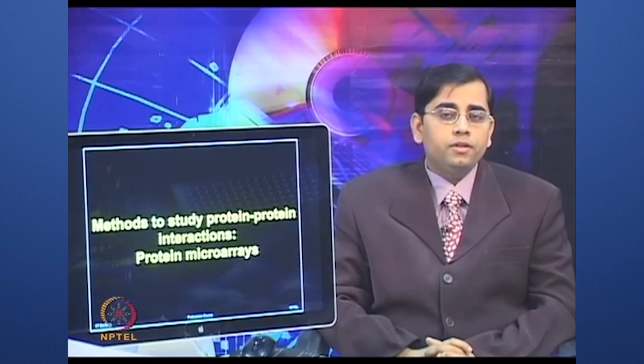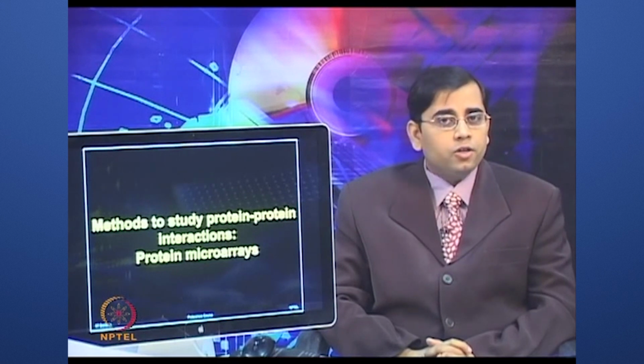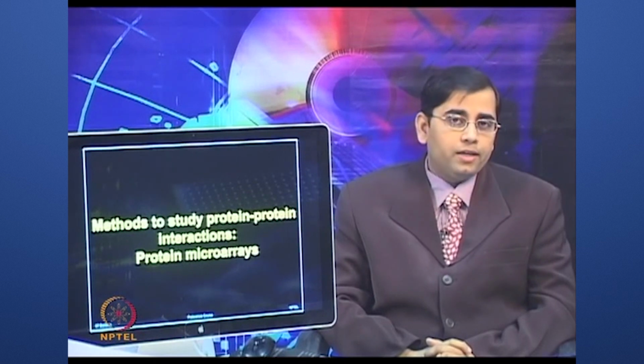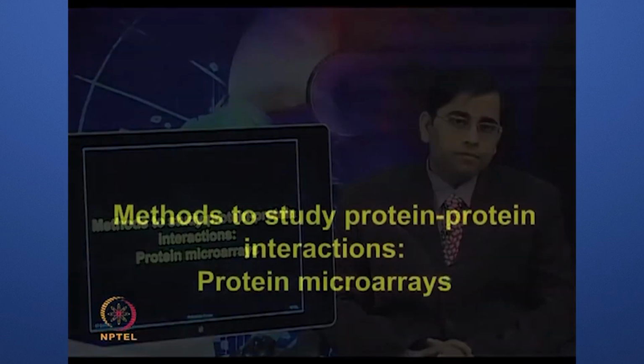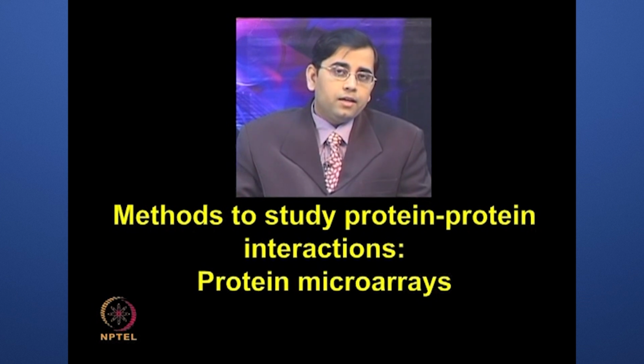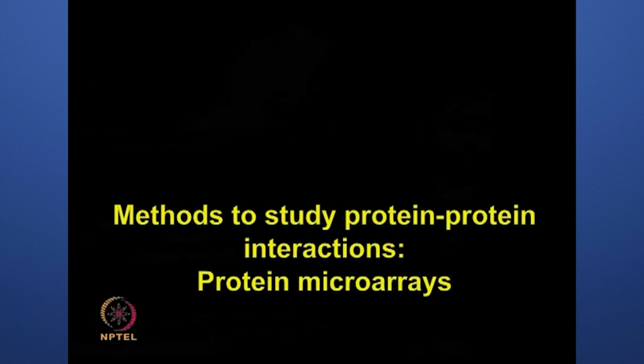After discussing different types of traditional methods which have been used for studying protein-protein interactions, now let us talk about some of the high throughput approaches which have also been used for studying protein interactions. Though many interactions are discovered by using yeast two-hybrid and immunoprecipitation studies, the reports of a high false positive rate as well as the poor reproducibility of some of the earlier discussed methods have been a limitation.